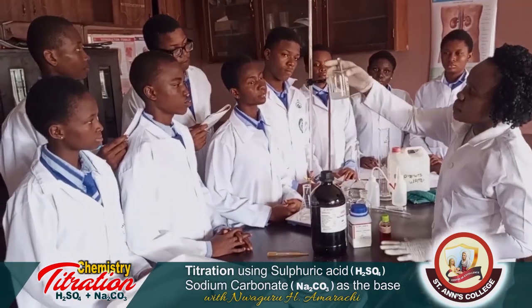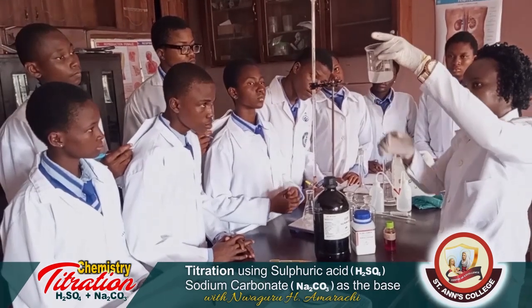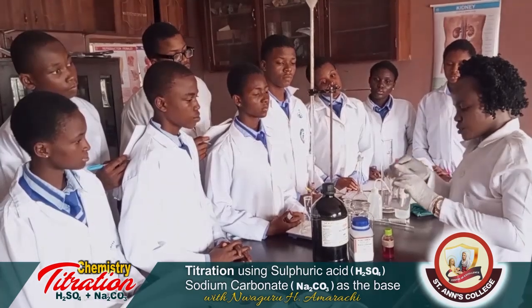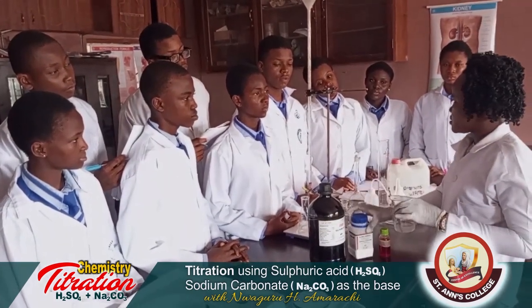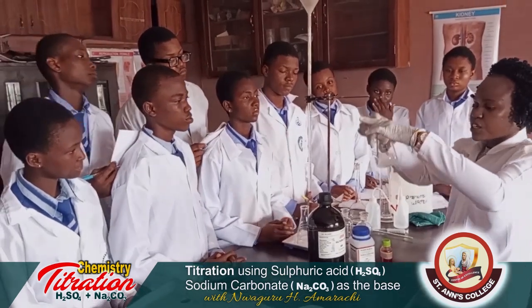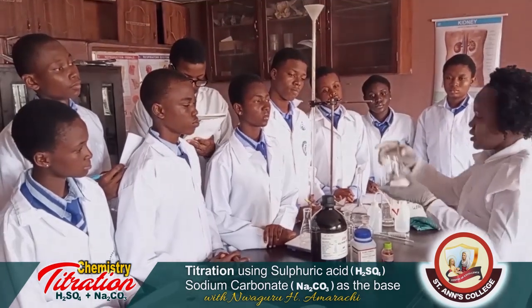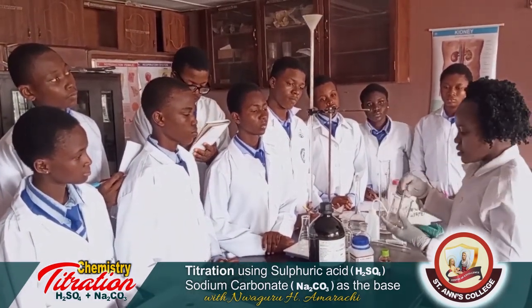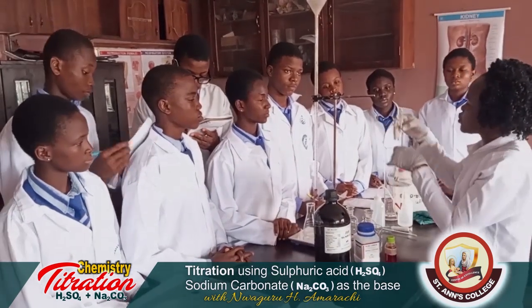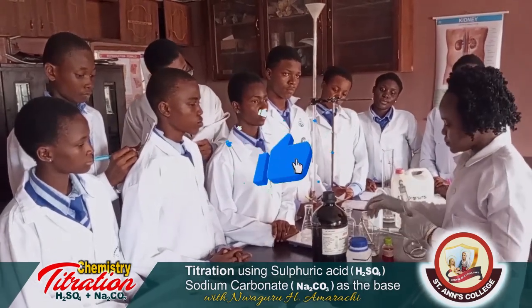Now, if you notice one thing about this sodium carbonate, you see that the solution is not clear. What made it not to be clear is because this is a weak base. And you know, weak bases dissolve partially. They dissolve partially, so it cannot be clear as a strong base. We're going to make it up using a 500 ml volumetric flask.